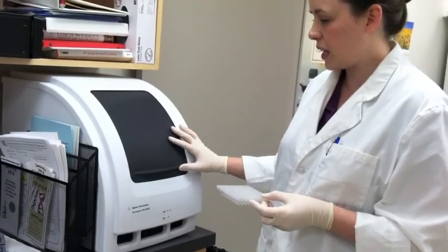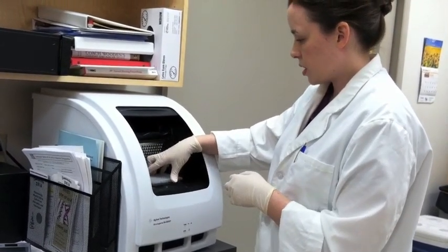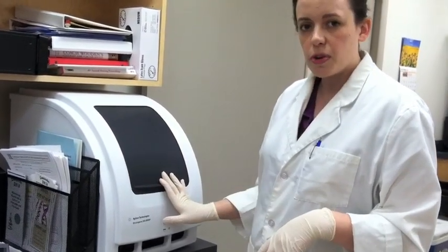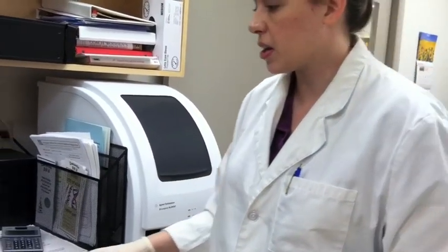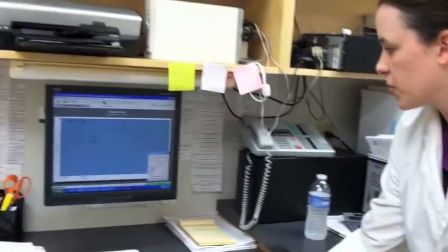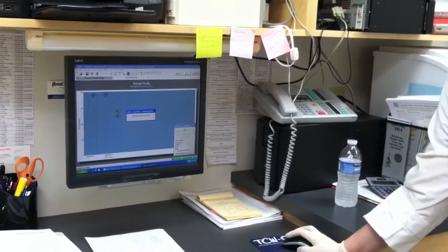The plate goes in here, like that. There's a computer program that controls the plate while it's running, so we'll start that. I press start, and you can track the progress on the computer.